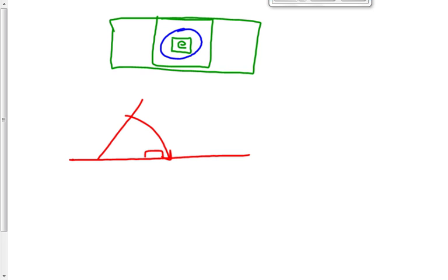Everyone's good with that? The lab drawing of the letter E will be done on scanning power. Not scamming, scanning power. It is the only lab drawing you will do on scanning power. The rest will all be done under high power because you won't see enough detail on scanning power to draw anything for the others.